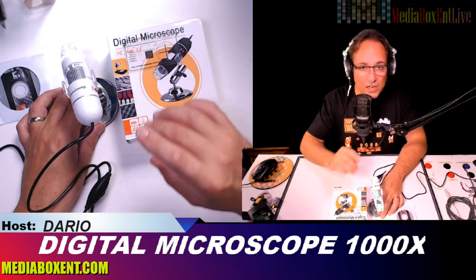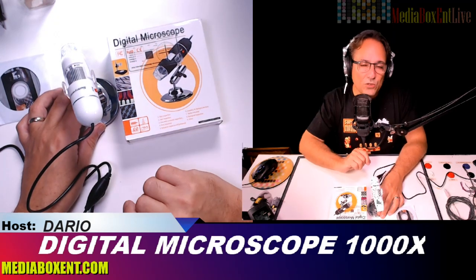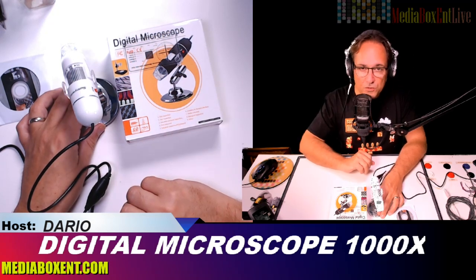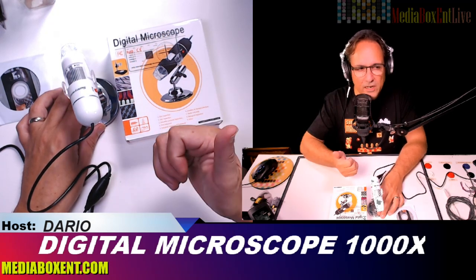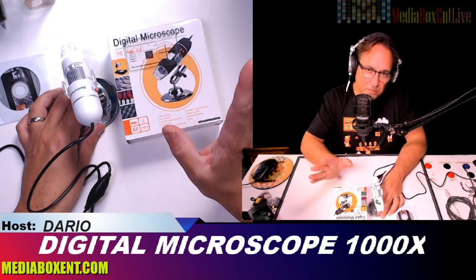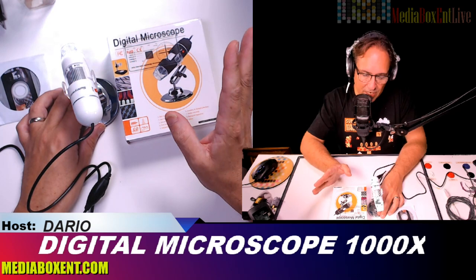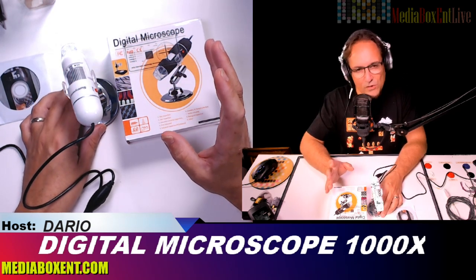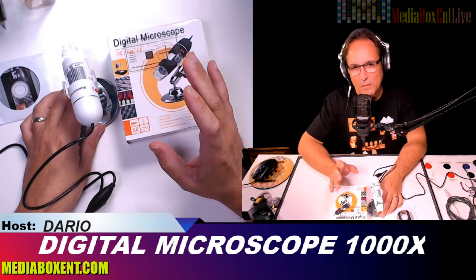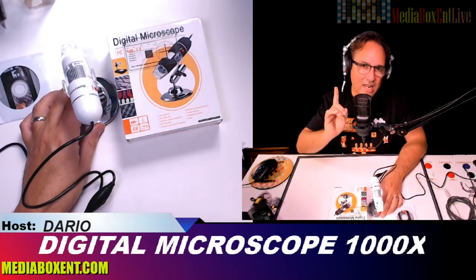Let's test the Sunny Wood 1000x digital microscope. This runs on USB 2.0 and 3.0, on Linux, Mac, even on a phone, but for today the experiment will be done on Windows 10. If you're looking to see tiny things, let's check it out and see what we can see with this 1000x digital microscope.